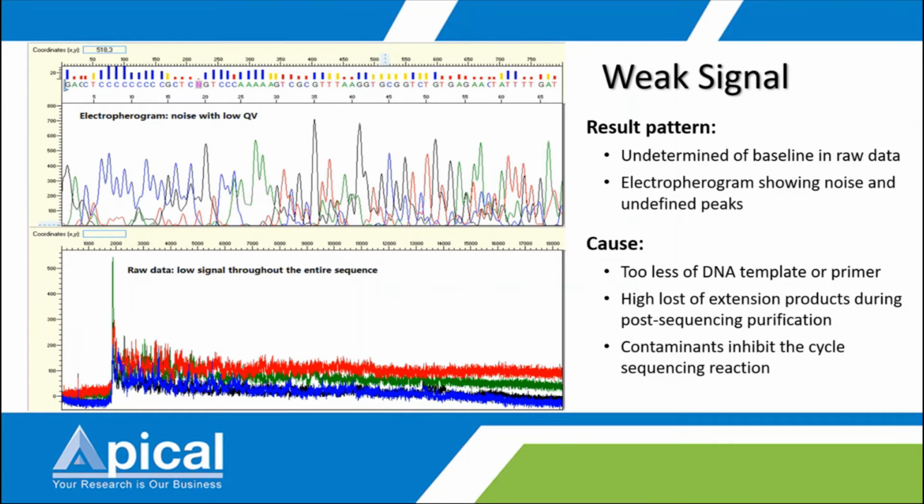There are other possible sequencing results that you will get. So this one is for weak signal.